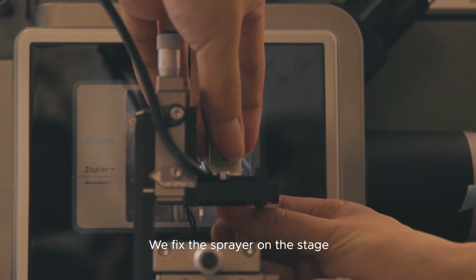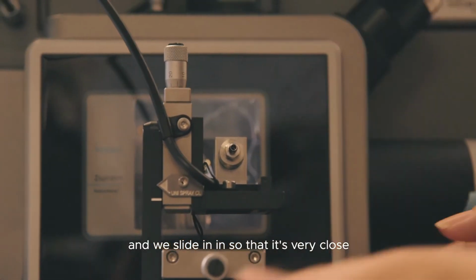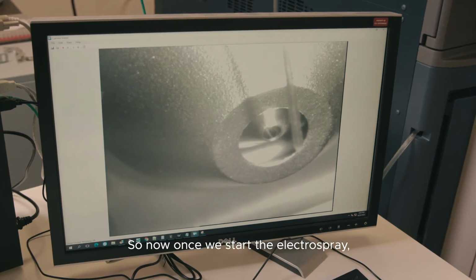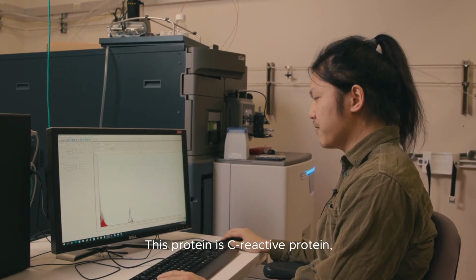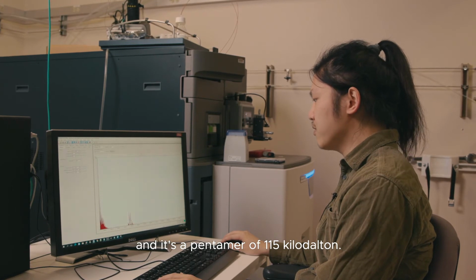We fix this sprayer on the stage, and we slide it in so that it's very close to the inlet of the mass spectrometer. So now once we start the electrospray, we'll see the protein signals coming out in this mass range. This protein is C-reactive protein, and it's a pentamer of 115 kilodalton.